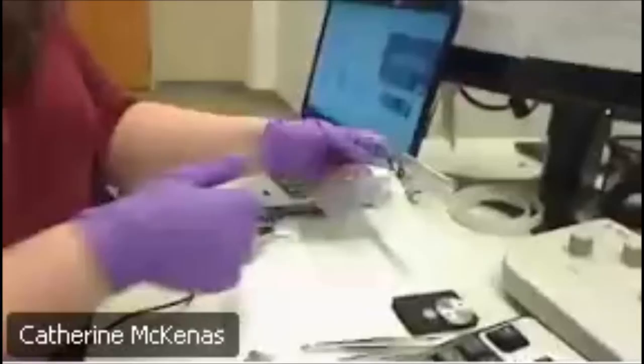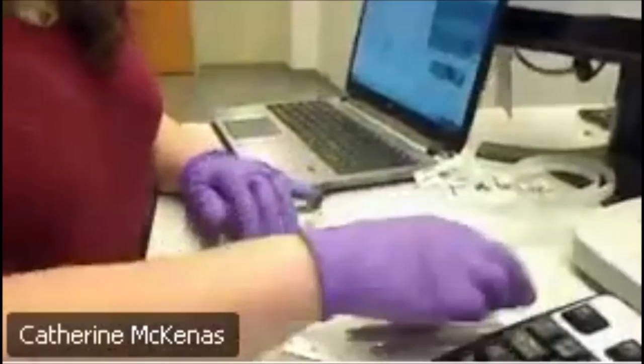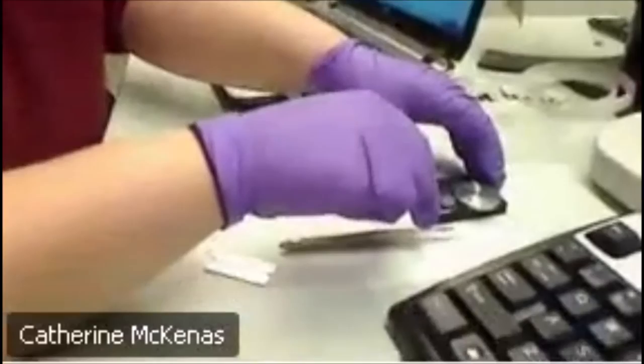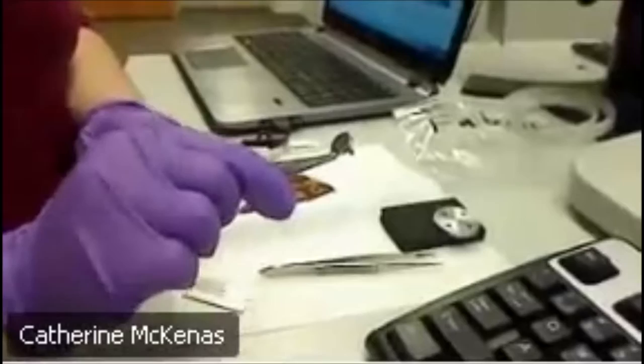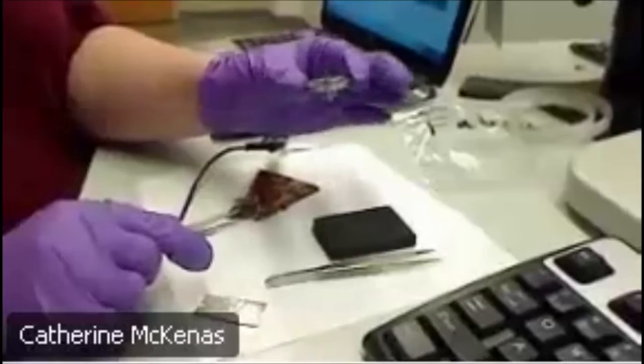First, I have your fabric sample, which is a very pretty piece of fabric. I'm going to set that down right there. I have a couple tools here. I have some forceps, a special kind that we can use to pick up this little stage. This mini stage is what we're actually going to put your sample on. It's very tiny, so I'm going to cut a piece of that fabric. Then this mini stage goes into this bigger stage, in one of those holes. This is what we mount into the instrument to look at your samples. We can look at four different samples at a time, as you can see here.